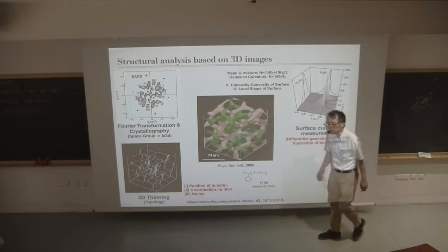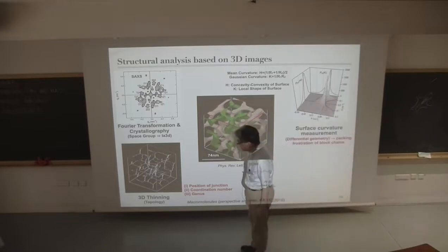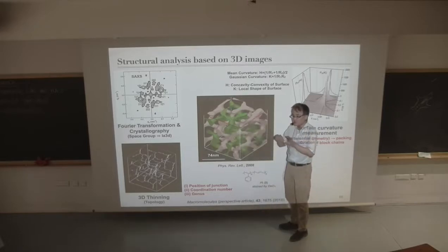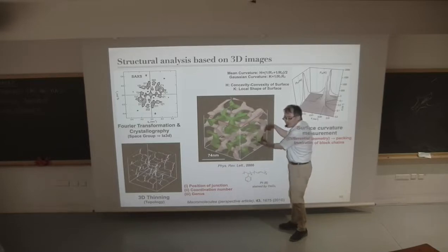Yes. Maybe a question. Why did you choose to put the polymer in green and beige and not use the same color? It's just because you have two networks which are important. Yes, I forgot to say that. These are two networks that don't intersect each other. So it's two independent networks. We have defects, of course. At the defect, sometimes this one and this one collide or connect, but basically these are two independent networks.